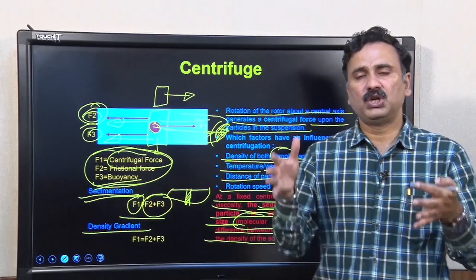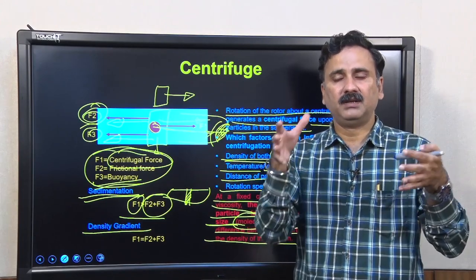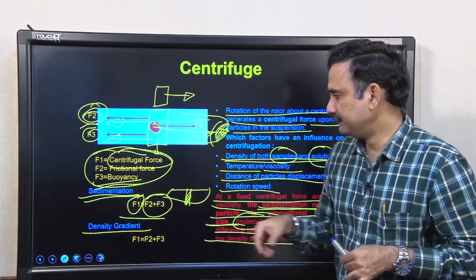So, the sedimentation of a material is going to be dependent on the size of the particle, the density of the particle as well as the density of that particular solution.